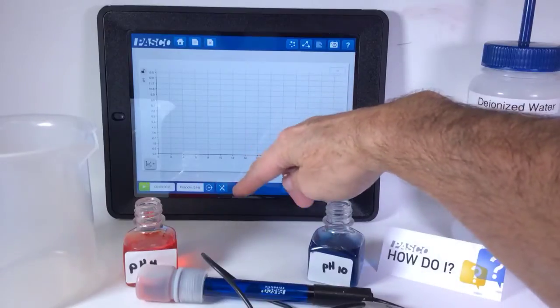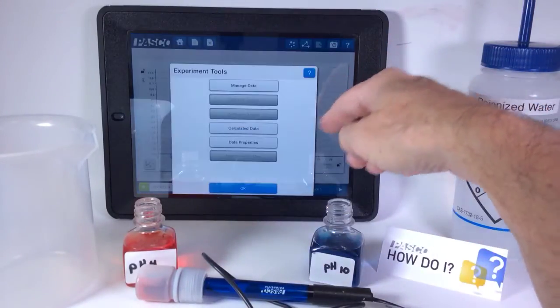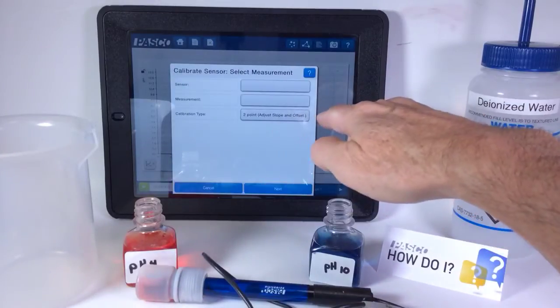Down at the very bottom, I see a wrench and screwdriver icon. I'm going to touch that. And after a moment, the calibrate sensor shows up. I'm going to touch that.